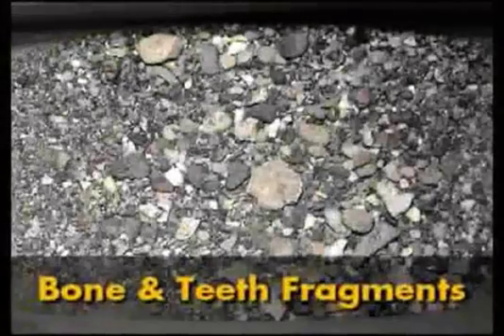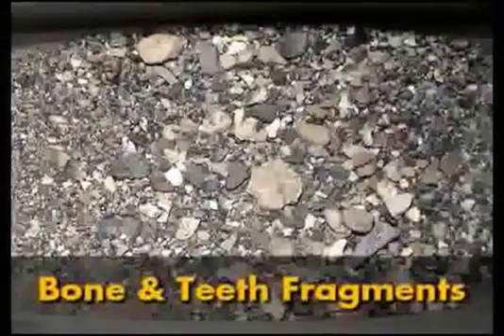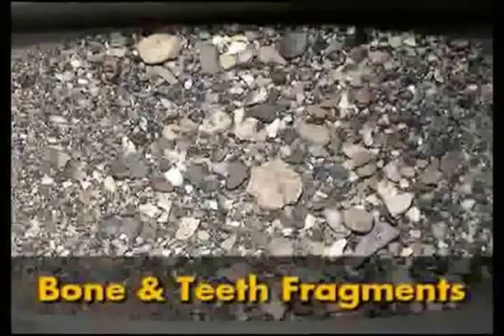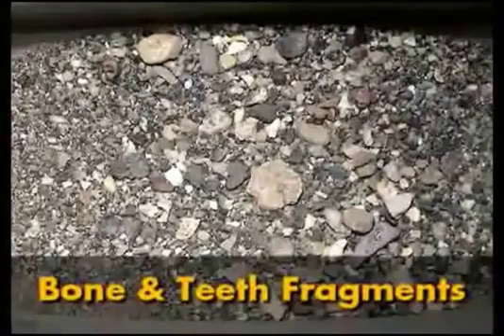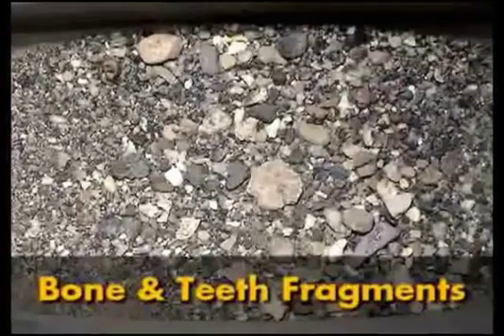Whether you are looking for a broken tooth at the site of a motor vehicle accident, processing the inside of a vehicle after a shooting, or processing a clandestine grave site, the most difficult evidence to locate is bone and teeth fragments. This photograph is of grave site dirt and gravel, with untreated human bone and teeth fragments intermixed. Some of these fragments are hundreds of years old, while others are recent. As you can see, it is very difficult to separate the fragments from the dirt and gravel.